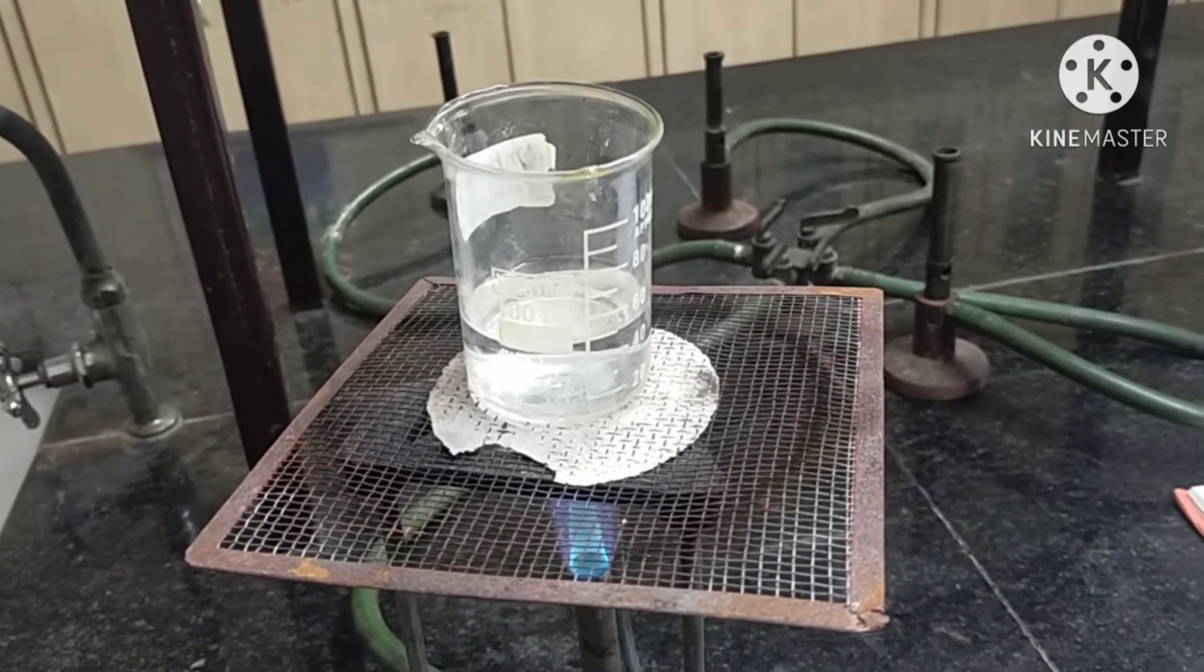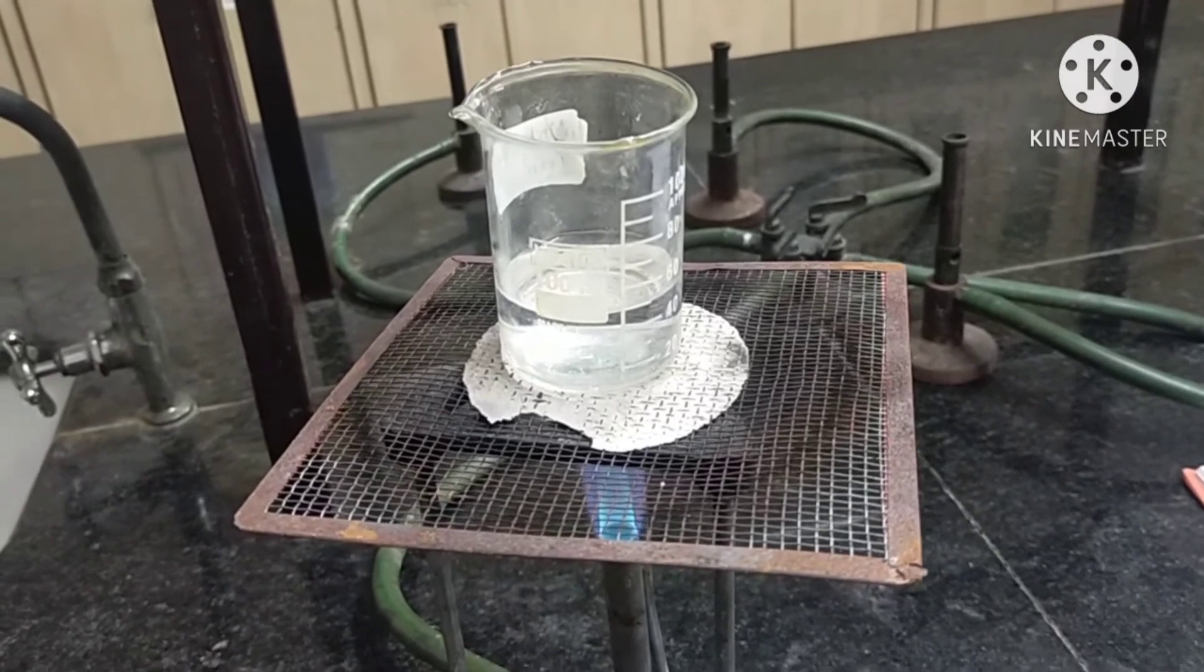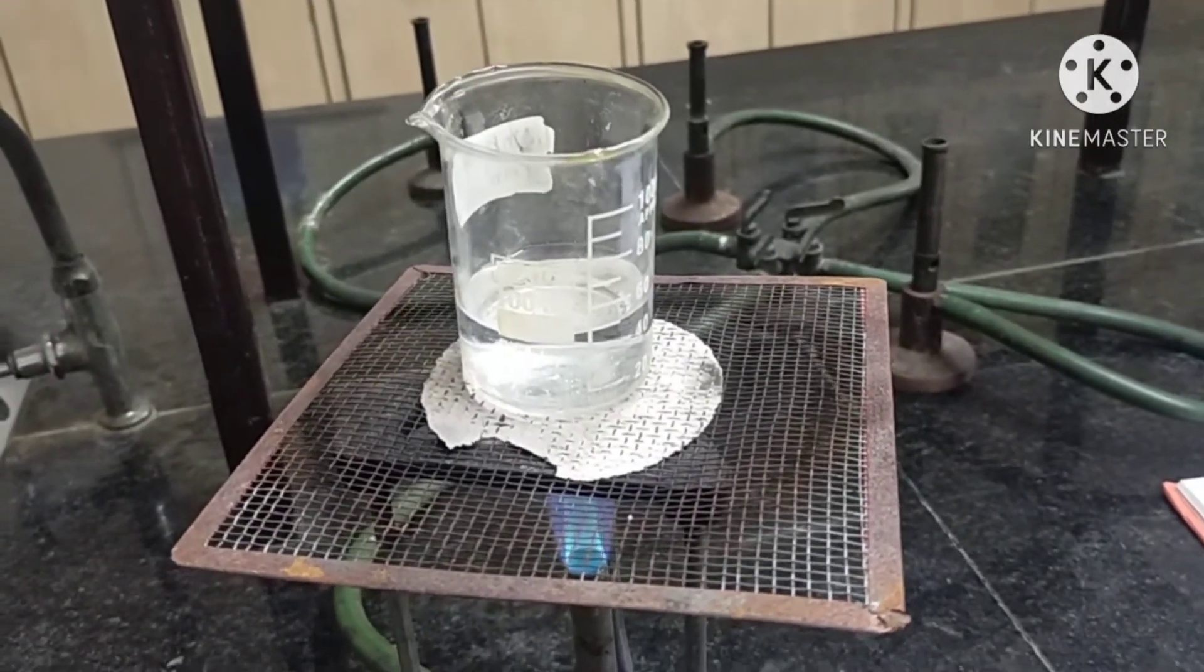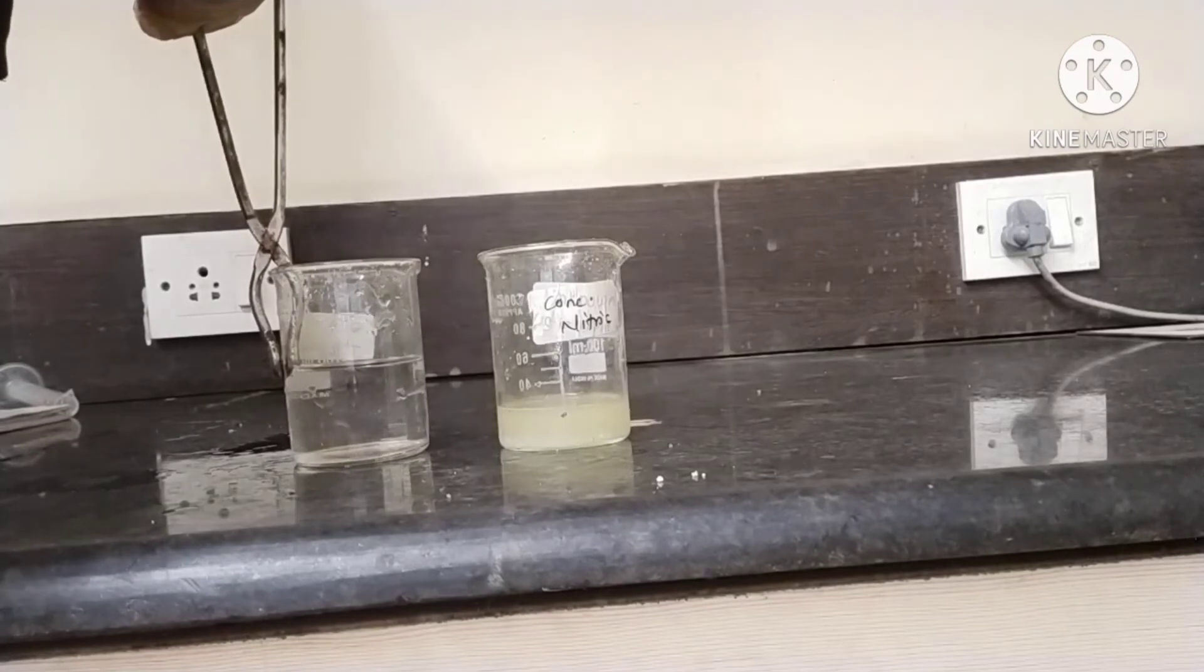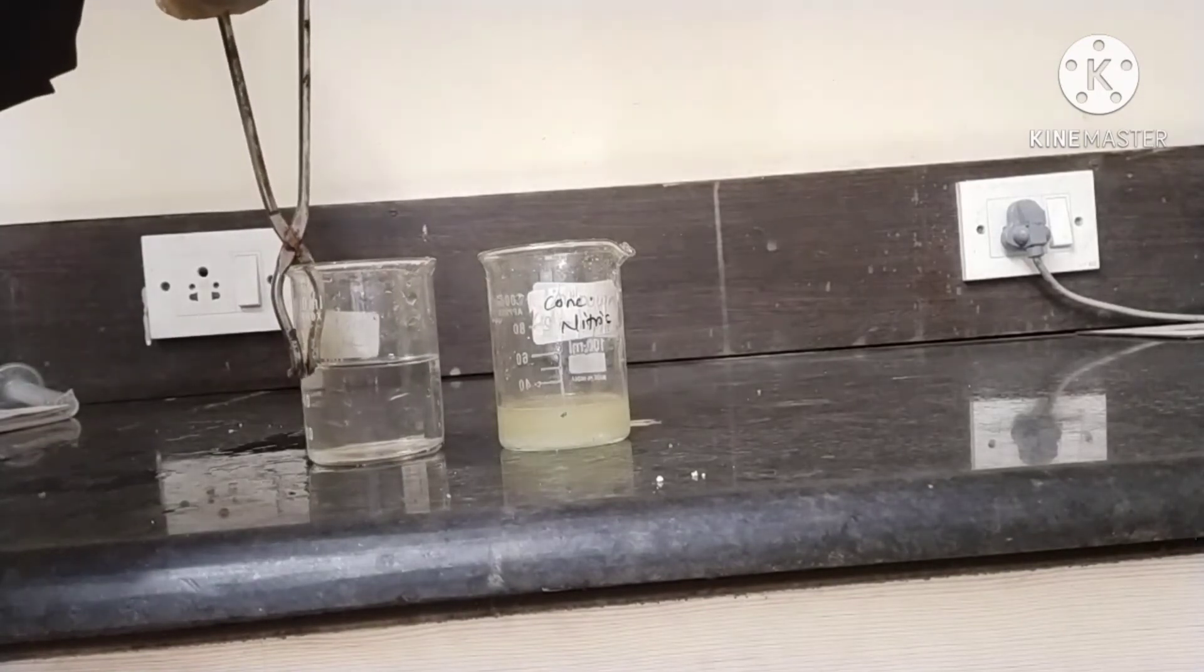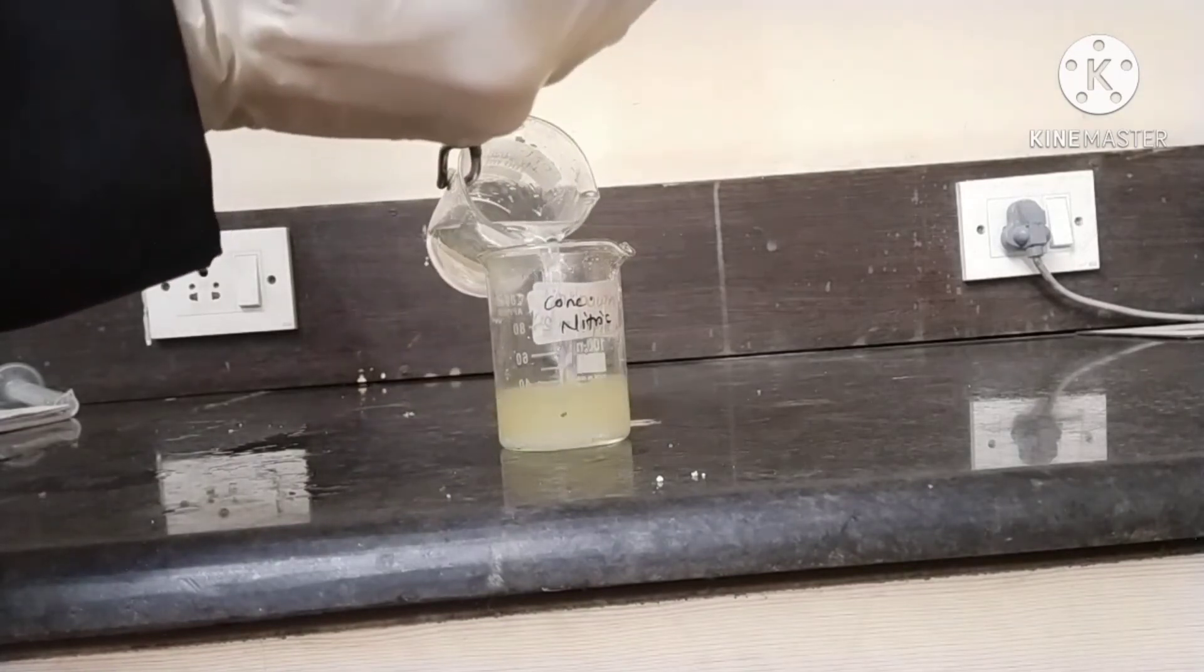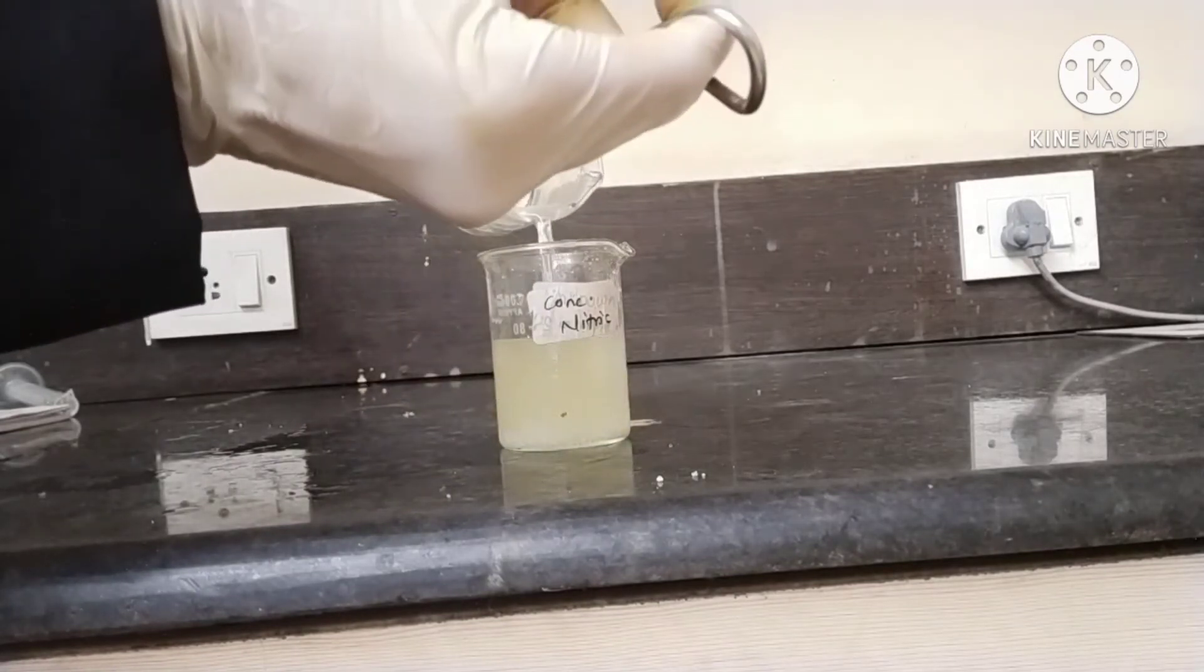Now after adding 20ml of distilled water, boil this solution for about 2-3 minutes over the burner. After heating this water, add the boiled water into the first beaker which contains both salts.